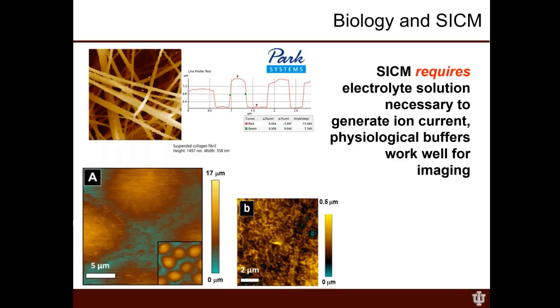Other techniques, for instance, something like STM, are really difficult to use under this kind of conditions. AFM is more difficult than typical AFM. It's manageable, but SICM is really geared to do this kind of measurement. And you can see an image shown here on the top. This is an image taken by Park.